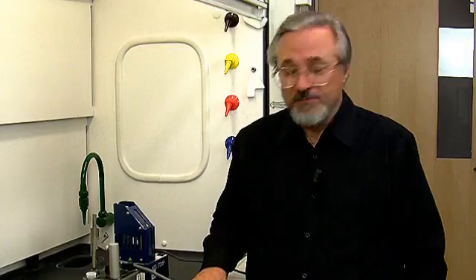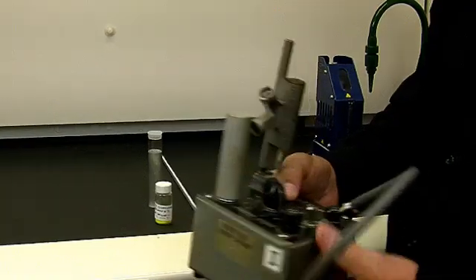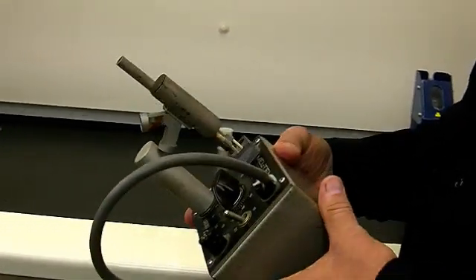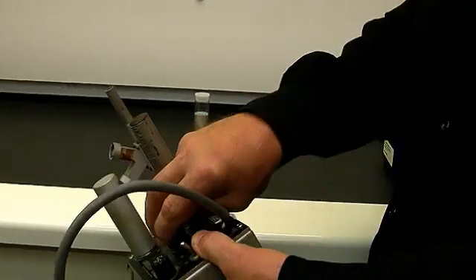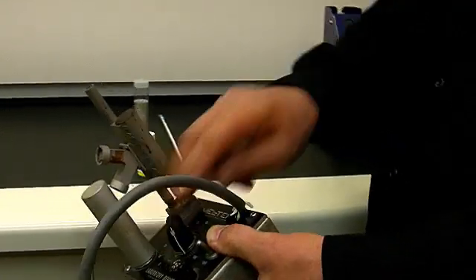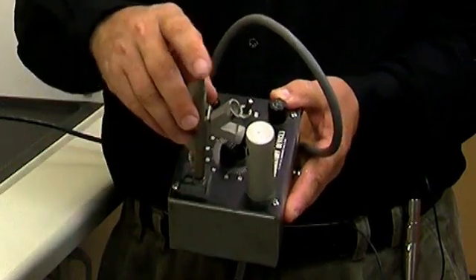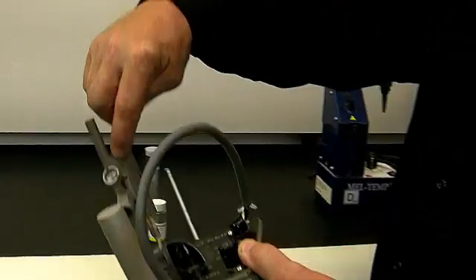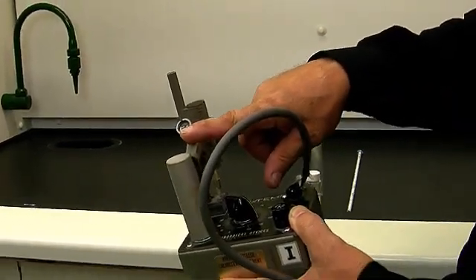One of the physical properties of a pure organic solid is its melting point, and we're going to demonstrate how we take a melting point. The apparatus we're going to use is called a melt temp. This is an older version of the melt temp, and it's constructed with a variac and a heated aluminum block which has a place for a thermometer, the samples, and a magnifying glass to see what happens as the solid starts to melt.